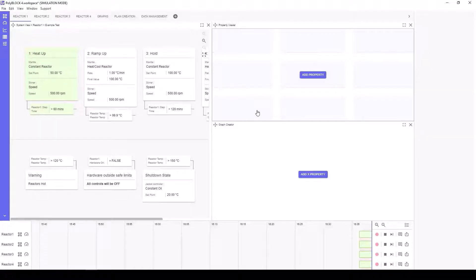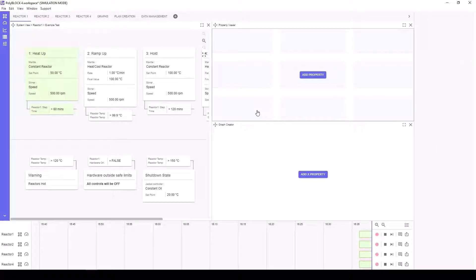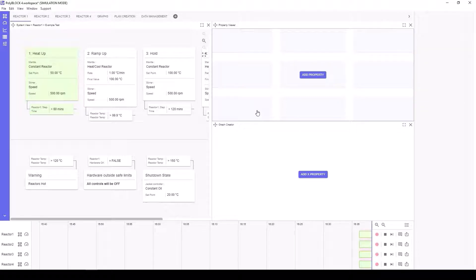Both the Property and Graph apps allow for viewing of key operational parameters of your HEL system. Here we have a plan active but an empty Property Viewer and empty Graph application.